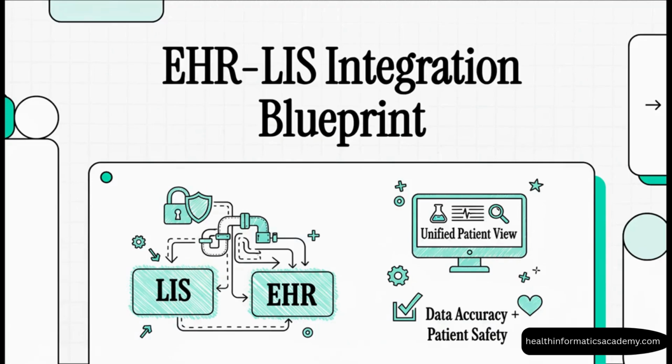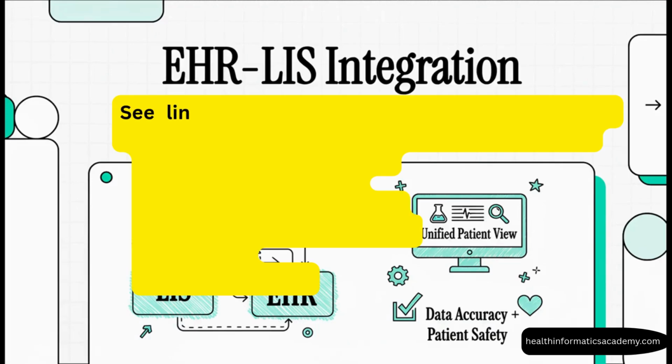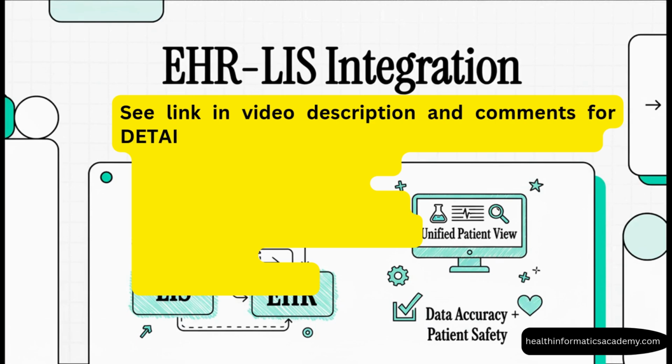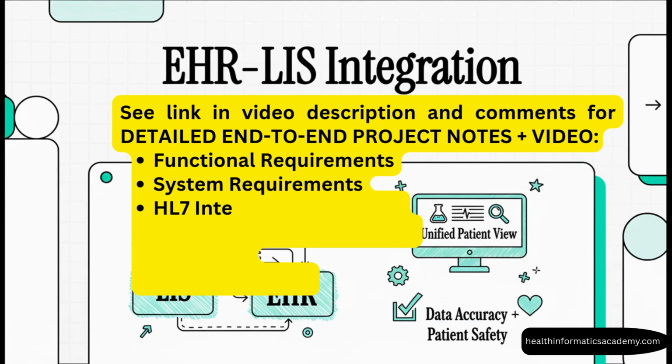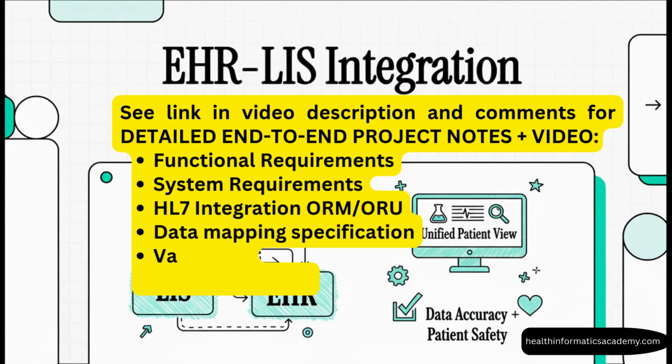All right, let's jump right in. Today, we're laying out the essential blueprint for one of the most vital integrations in all of healthcare IT, connecting an electronic health record, or EHR, with a laboratory information system known as an LIS. This connection is the absolute foundation for timely, accurate clinical decisions, and there is zero room for error.